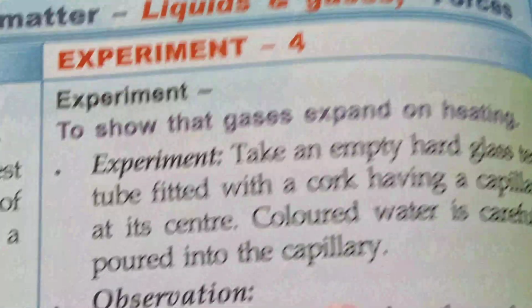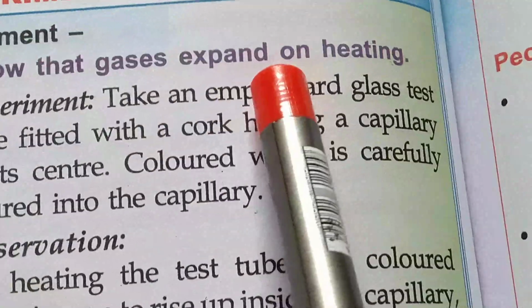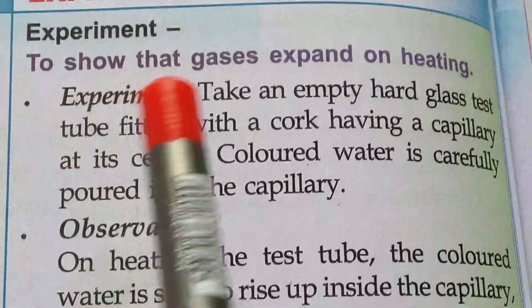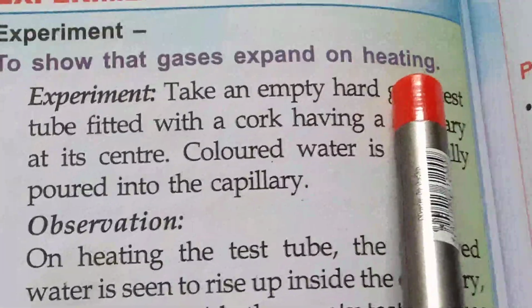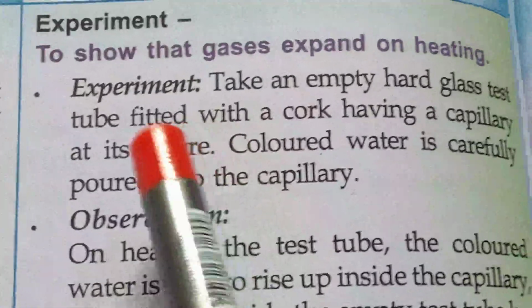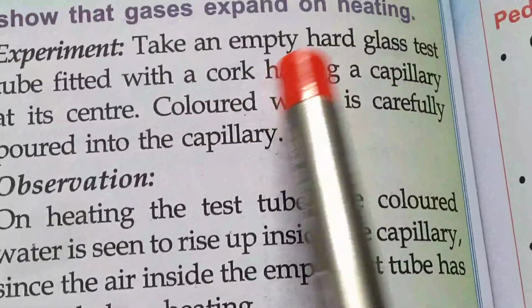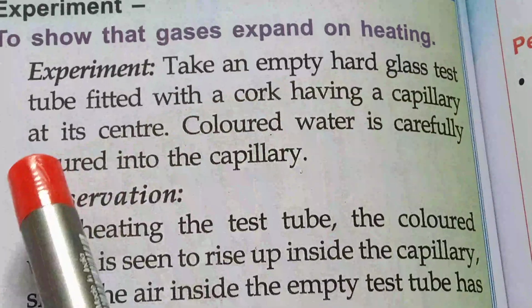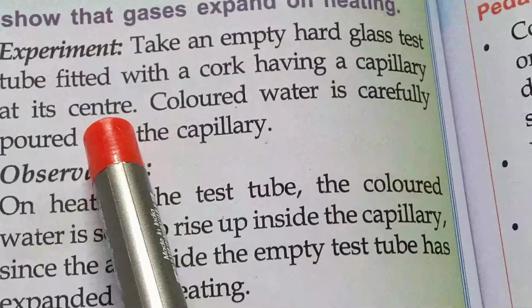Next, another experiment to show that gases expand on heating. In the same way as solids and liquids, gases also expand on heating. Gases also expand after getting heat. How will we prove it? Take an empty hard glass test tube fitted with a cork having a capillary at its center.